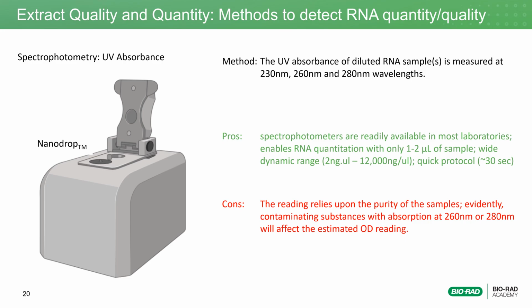The various molecules collected that are not nucleic acids interfere with obtaining a true correlation between absorbance of the nucleic acids, and without an effective method to tease out these effects, the reported concentration is rarely accurate. However, if the reported quality is relatively pure and the reported concentration is abundant, you can likely use the reported concentration to proceed with subsequent RT-qPCR steps.